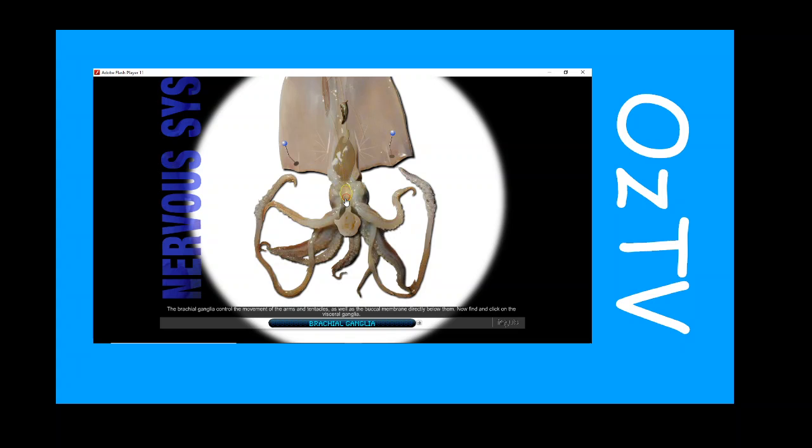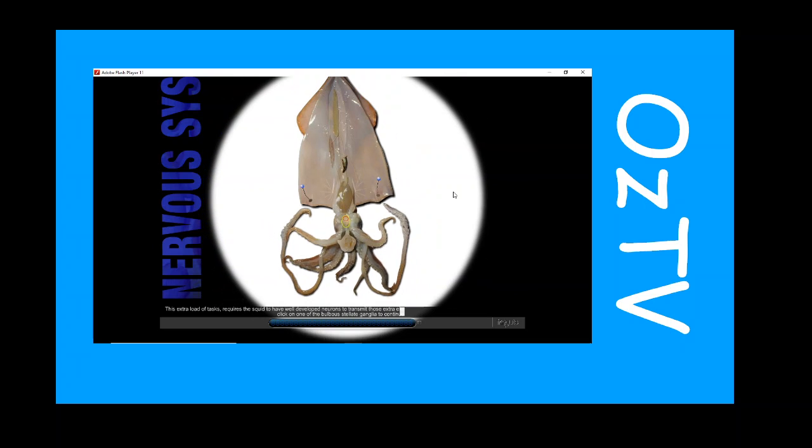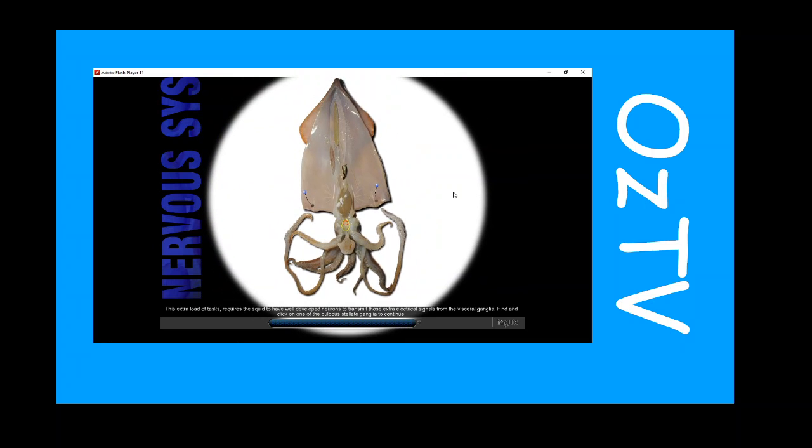Now find and click on the visceral ganglia. The pair of visceral ganglia control the mantle functions of locomotion and respiration, as well as the movement of fins, gills, and chromatophore patterning. This extra load of tasks requires the squid to have well developed neurons to transmit those extra electrical signals from the visceral ganglia.